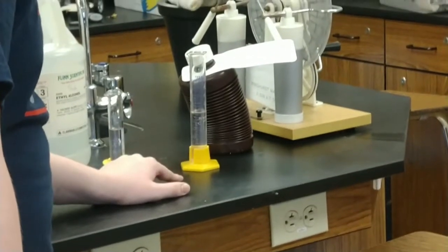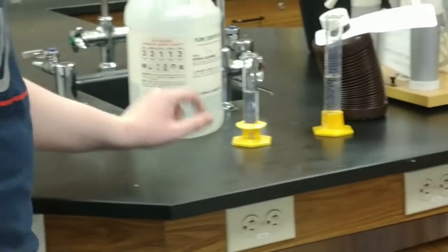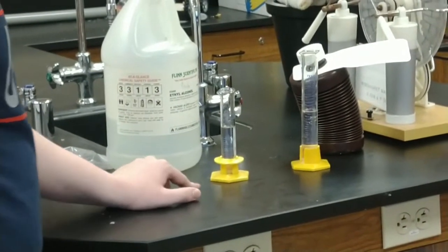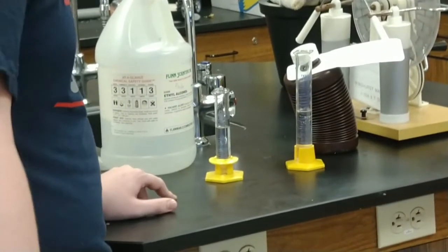First, we have our 30 centimeters cubed of hydrogen peroxide, and then we have our 20 centimeters cubed of ethanol, which we mix together and set on fire.